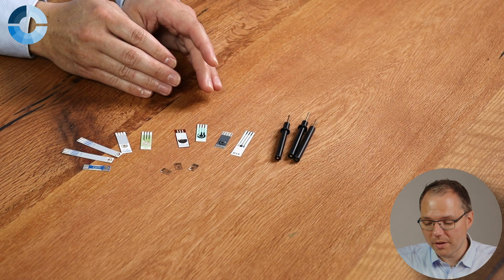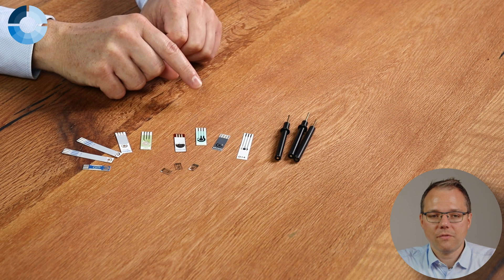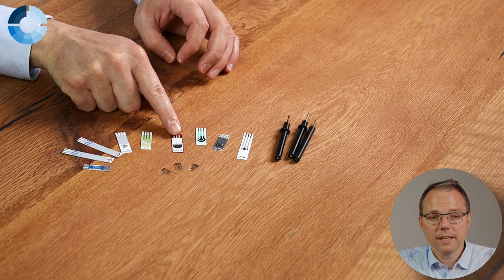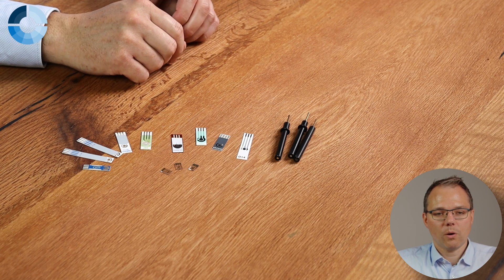Most electrodes use graphite as the basic carbon material. We offer one type with a very special material — the gsense electrodes from the company Integrated Graphene, which feature a 3D graphene foam material grown directly on the electrode rather than deposited or printed. This material has very low charge transfer resistance and is highly conductive, almost behaving like metal, though it is more complex to manufacture and therefore slightly more expensive than other carbon electrodes.